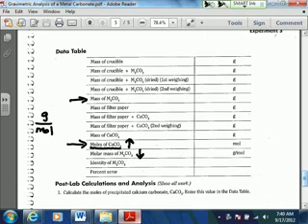Anything you can think of that would make this mass higher would make the molar mass higher, okay? So those are the sorts of things you need to be thinking about on that question, all right? Okay, hopefully that makes sense. Again, pretty simple lab. You guys should do fine with this one. So, all right.